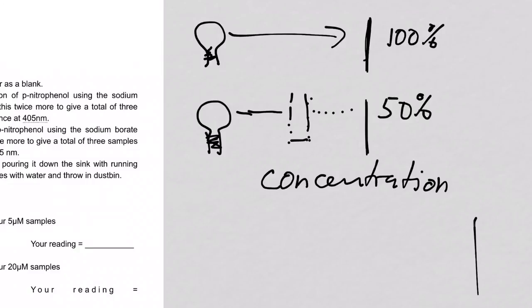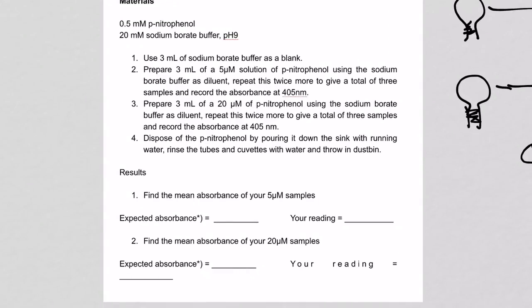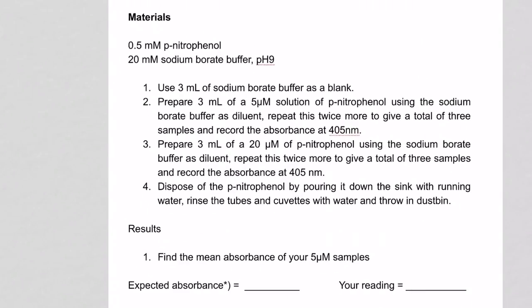We will discuss that in more detail next week, what's happening. Now, for our experiment that we are using here, we use a solution of this compound, para-nitrophenol. Please be careful. It's slightly toxic, especially when you inject that straight into the brain, which I hope you won't. Treat it with respect. Health and safety rules apply, gloves, and so on. You probably want to even wear safety specs, because that is something that you don't want in your eye.